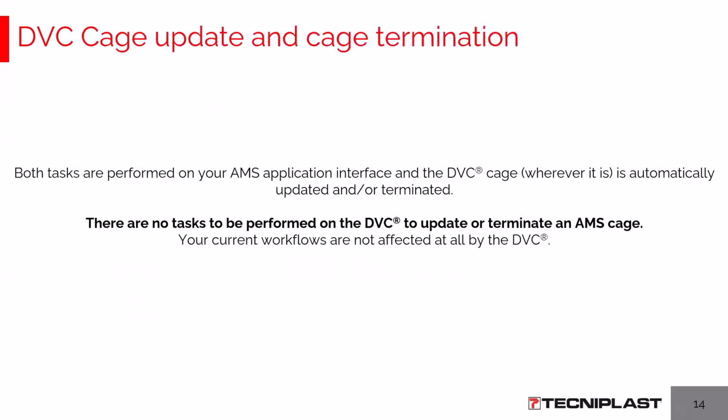And so, again, as said, compared to the DVC operator interaction, we believe that directly interacting with the DVC master interface is much more streamlined and faster than before. Last point of the cage life workflow I suggest following is regarding the cage update and cage termination, whenever a cage has to be updated regarding the content or if it is terminated.